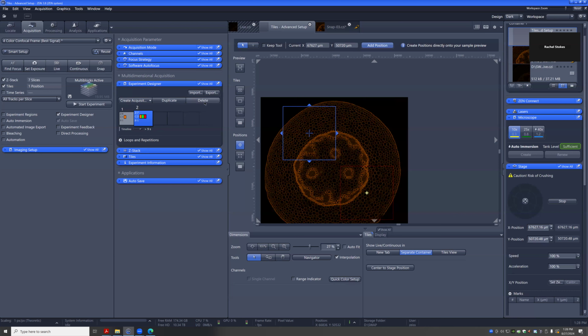What is the difference? You also have automation, so that's also working. Automation is more with code. So if there's an experiment that is not covered by the software, automation will have to write macros. That's another step, where if we wanted to have external software do parts of the workflow and then come back. Most typical applications, it's not really something you would use, but this checkbox is always there.